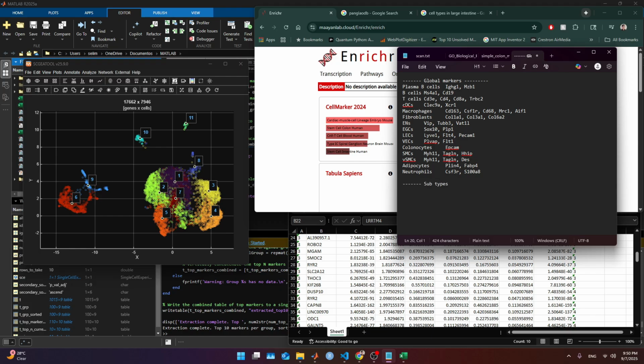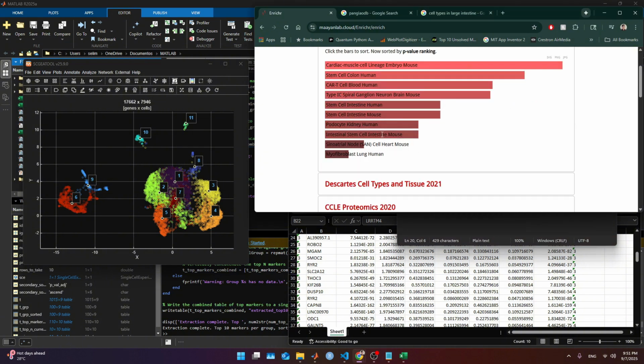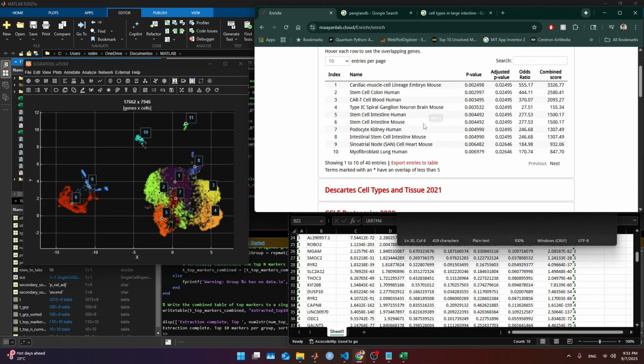For example, I can just call this stem, and that stem is gonna have the markers potentially that are lighting up here. Those are here. I want to see what's in there.